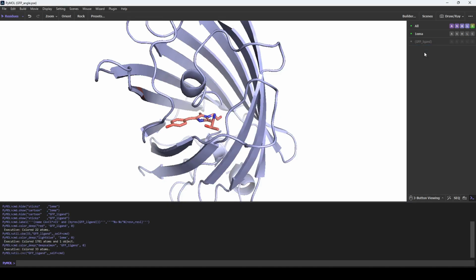Now that the protein and its ligand have been recolored for visibility and aesthetic purposes, you can render an image. First, we need to adjust the pose in the viewport. The pose will depend on what you are trying to demonstrate, or the story you are trying to tell. In this case, we want to highlight the directionality of the beta barrel and the ligand in the internal cavity.